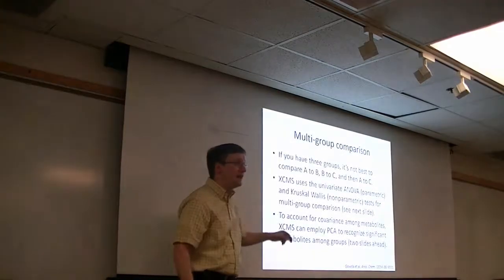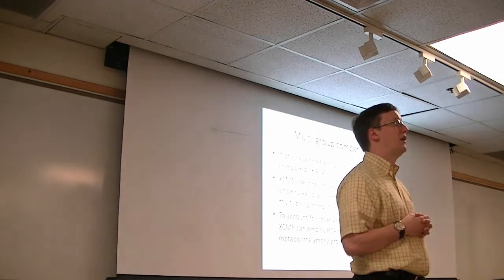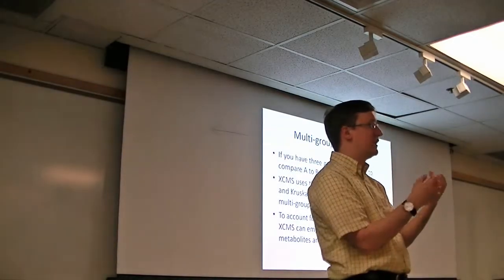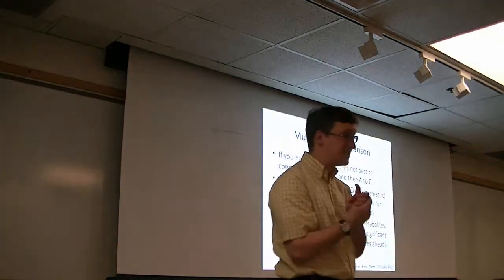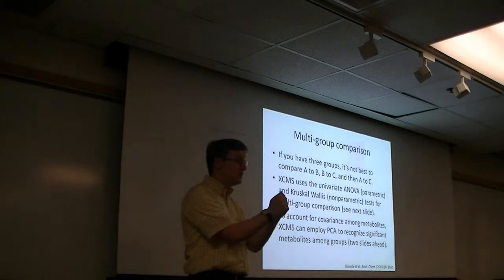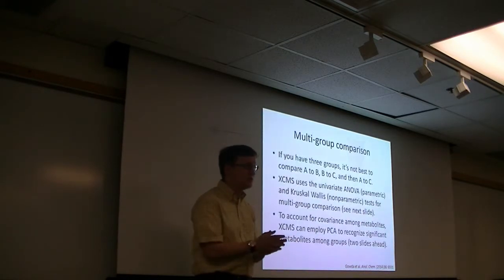It may be that many different metabolites are all signals of the same thing, right? So what if, for example, all the PCs, the phosphatidylcholine lipids in a sample are happening in concert? What if they are all rising together? To treat each as an independent signal would be kind of a mistake. So you can use principal components analysis to recognize the covariance of these lipids together. As they covary, they can be grouped together in a single component that you can use to explain your results a lot more compactly.